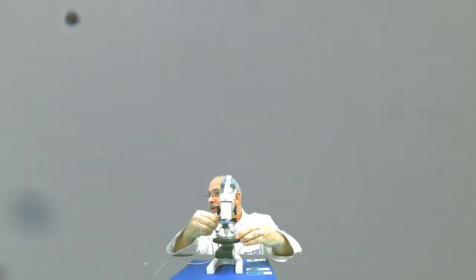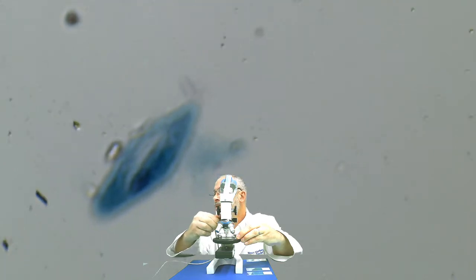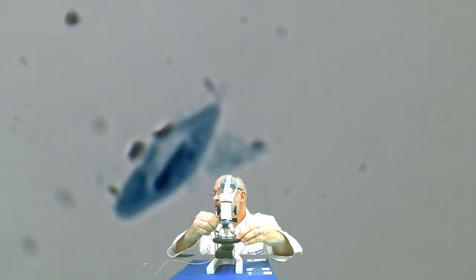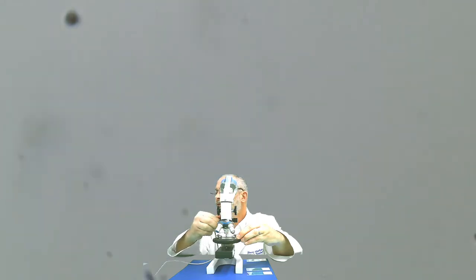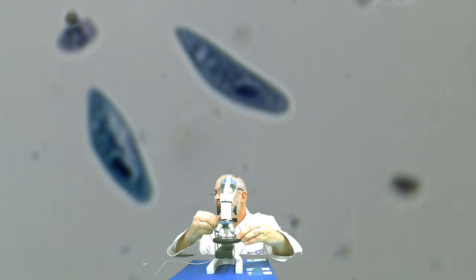Paramecium. Let me get some Paramecium into view here. Here we go. Hold on. Let's just get this Paramecium into focus. And as I'm focusing, I want you to try to do something in your observations.